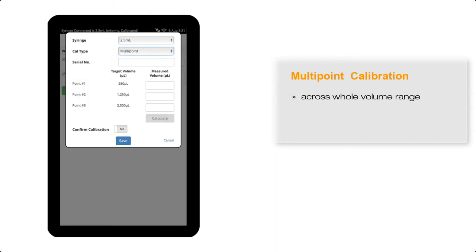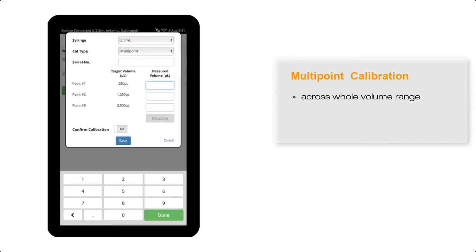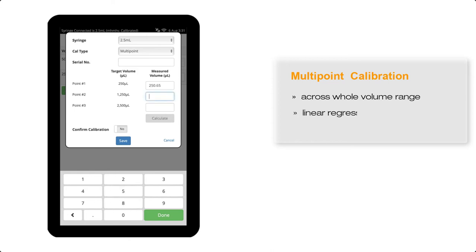So for the 2.5 mil syringe, this would be the range from 250 microlitres up to 2.5 mils. The syringe is calibrated using a linear regression approach, and three measured volumes are recorded at 10%, 50%, and 100% full-scale volume.